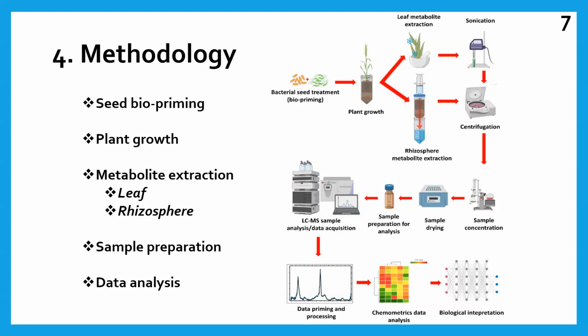But they had investigated the physiological impact, which means that we are looking at the plant physiology in terms of appearance, on what these PGPR do to those plants. And they discovered that they promote what we call root elongation, root bulkiness, and also plant growth, which means that when you compare to controls, you find that the growth of the plants that are treated is a bit higher. So for this study, we opted to see what is happening at a molecular level. So I hope that answers your question: this was sort of a follow-up study where we got these bacteria that were already studied on the impact. I think some of them they even studied for nitrogen fixation and phosphorus solubilization, and other studies such as siderophore secretion. Then he shared these PGPR with us, and all we wanted to see is what do they do at a molecular level?